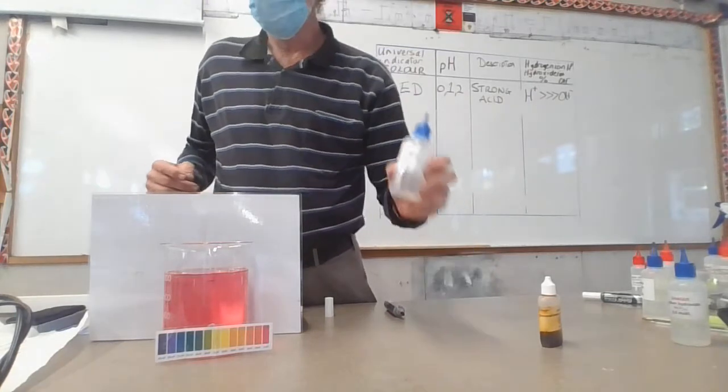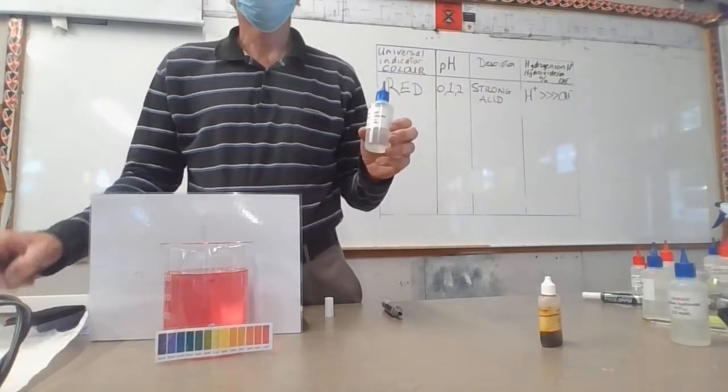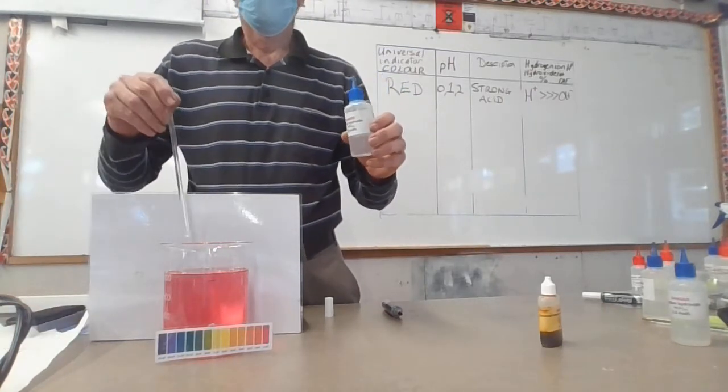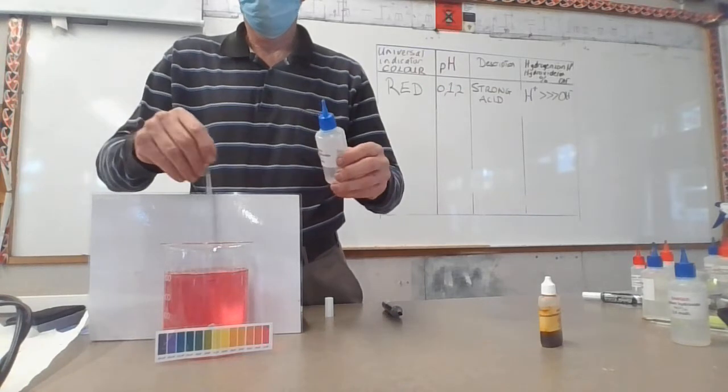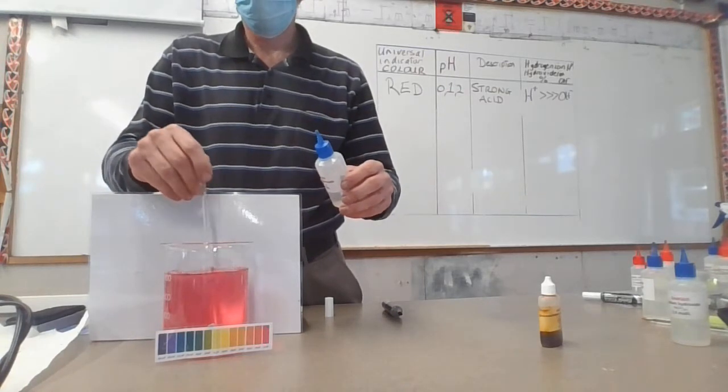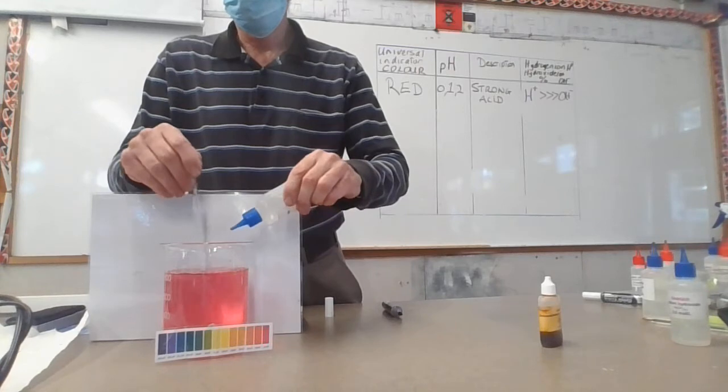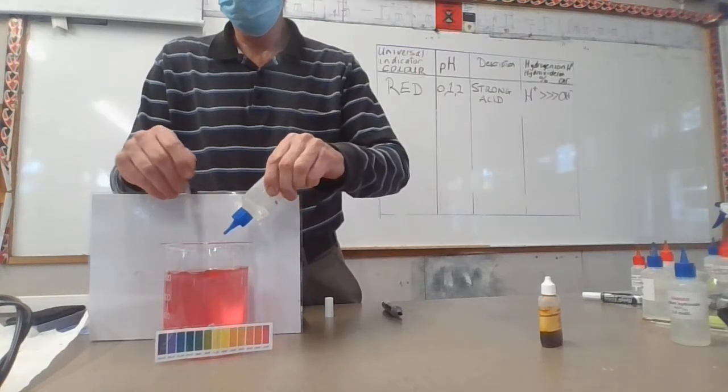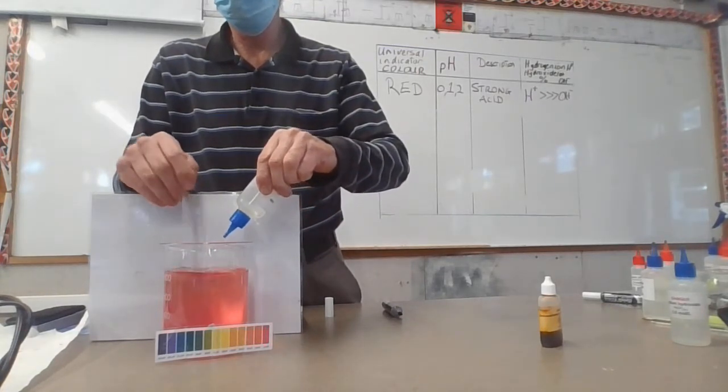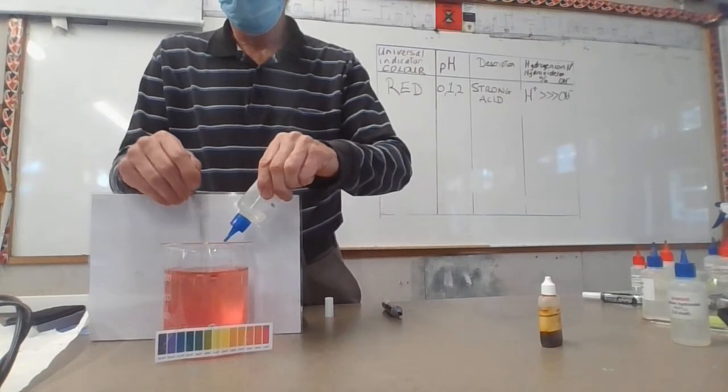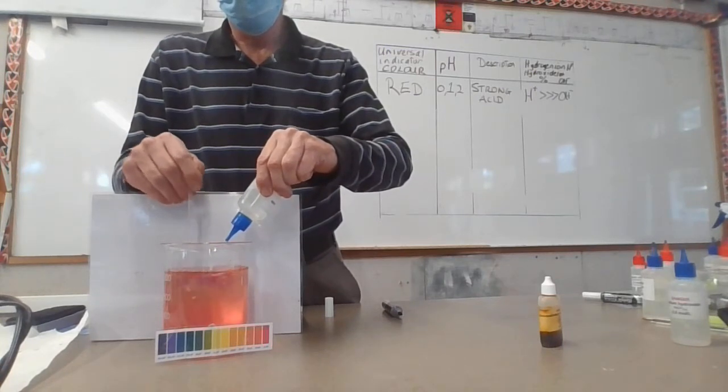Let us carry on our neutralization reaction. Remember, neutralization or neutral is usually worth a mark somewhere in our paper. Let's continue our neutralization of the acid by adding a base. I'm using sodium hydroxide here, and the next color should be orange.